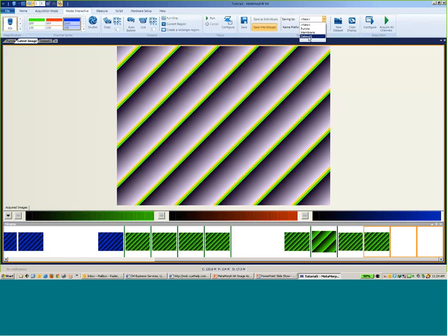You can configure hardware to emulate, so you can have some fake hardware available to you, and then just run through some of the different acquisition modes that are available and play around with those settings and controls. And then as I said, in 2 weeks, I'll have images and some more formal exercises for you to run through for the actual analysis portion. The presentations are being recorded, so they will be available. I'll send the links to Jake, allowing you to download and view them at a later time. So if you need to review some stuff, you will have those available.